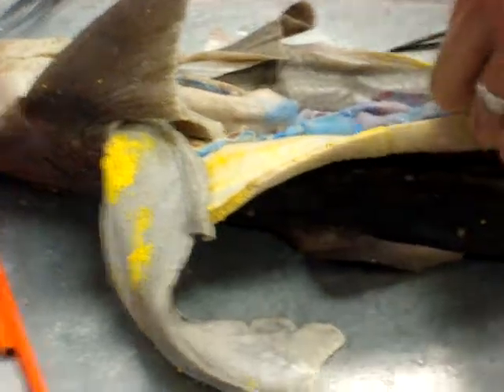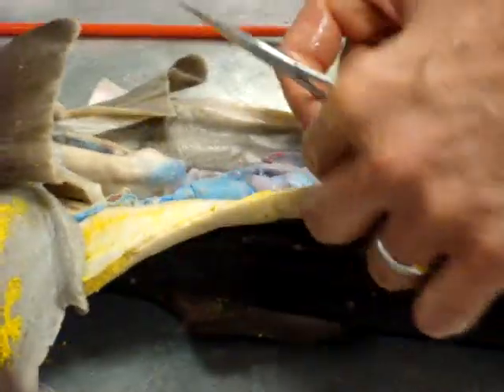Okay, so getting inside of this guy, as we open it up, we'll begin to notice... That looks delicious. I want some of that. What we call the spiral valve. Just like the rugae in the stomach.